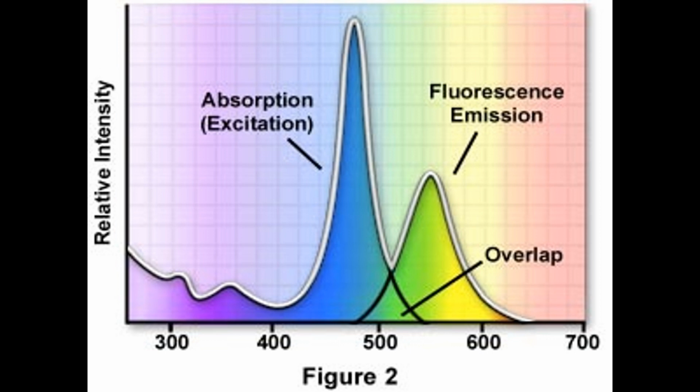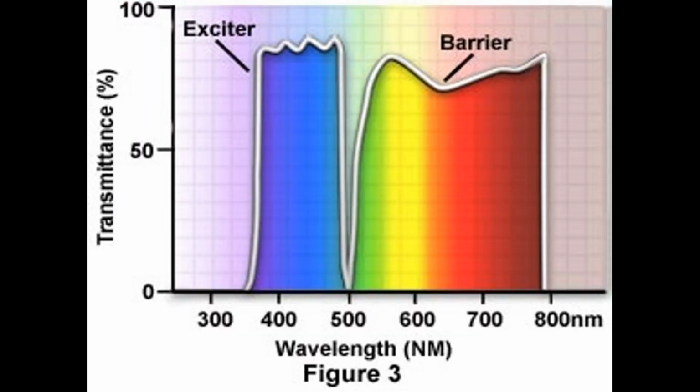So a lot of this depends upon the filters. And it filters on your camera and it filters on your eyes. Now the glasses we were wearing were not filter glasses. They're clear. But you can buy orange or blue blocking glasses, and so you wouldn't see that light at all. And you'd just be shining it around, and the only thing you would see would be the fluorescent light coming through. That's the most sensitive.